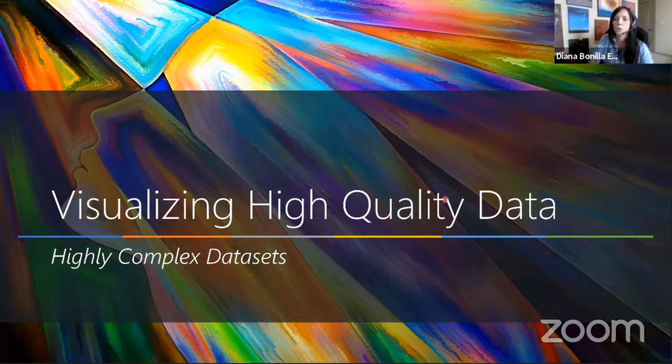But the other half is now knowing which analytical tool I should use, how I can use it, what algorithm, what pipeline, what software to go for in terms of automated data analysis. And that's part of the goal today. And it's especially difficult because there has been a surge in the development of computational tools to overcome all the limitations of manual gating. So it's important to know what the guidelines are to decide.